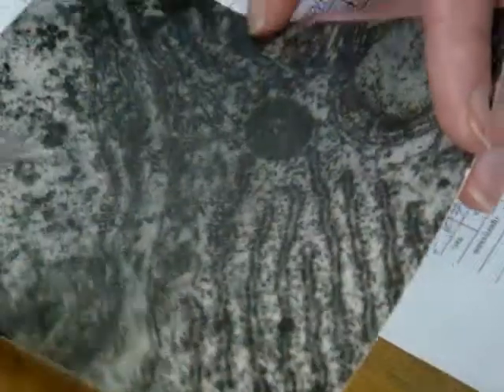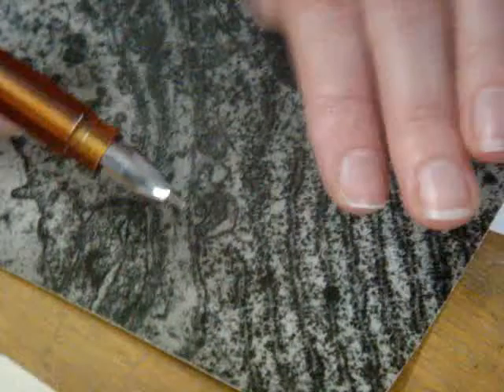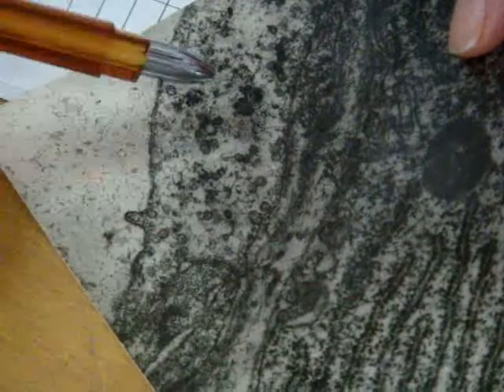And one more electron micrograph. It's dark enough. Look please, we can see rough endoplasmic reticulum, Golgi. It's underlain by basement membrane, so this is epithelium. And here we can see lumen. So yes, this blood vessel is also underlain by basement membrane. That's all.